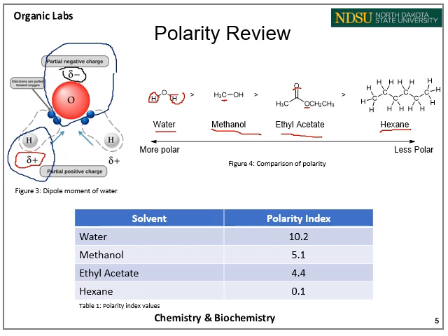Another thing that I want to point out is that polarity can be quantified numerically. There is a polarity index online, which I've shown on the bottom in table 1 with some values of some common organic solvents. The higher the value, the larger the polarity, and the lower the value, the lower the polarity.